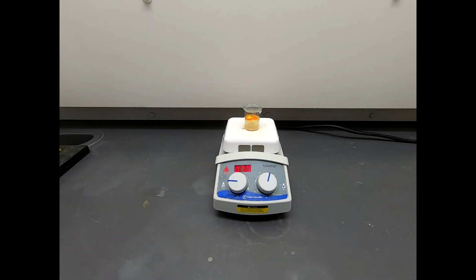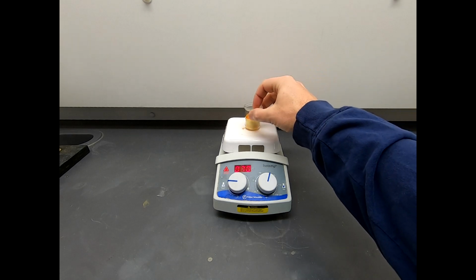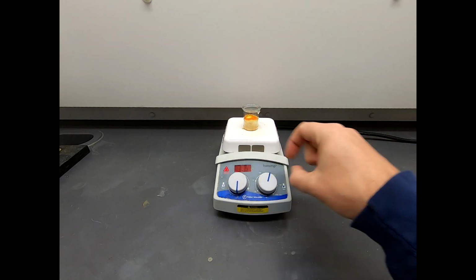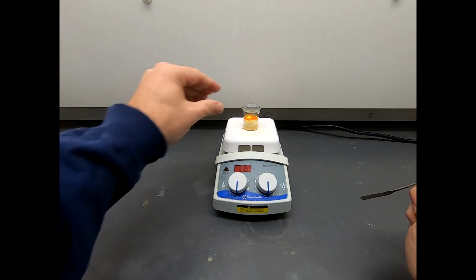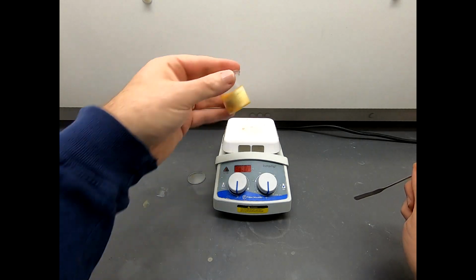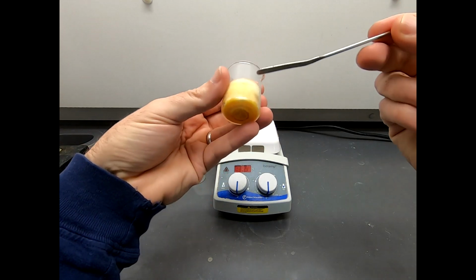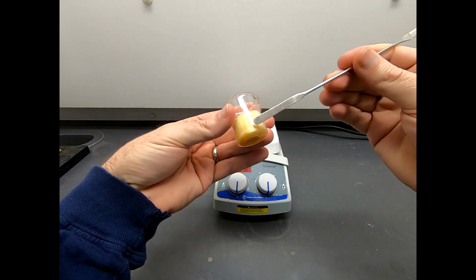Well, this reaction has been stirring for about 20 hours. And as you can see, it has completely solidified. So I think we're done with the heat. Let's turn that off. We can turn off the stir plate because that's no longer doing anything. And now let's look at this mixture. So this is completely solidified top to bottom, and it is just a touch warm on the bottom.